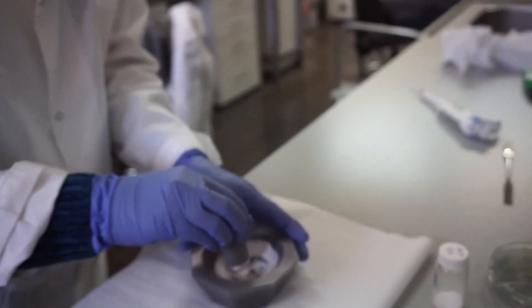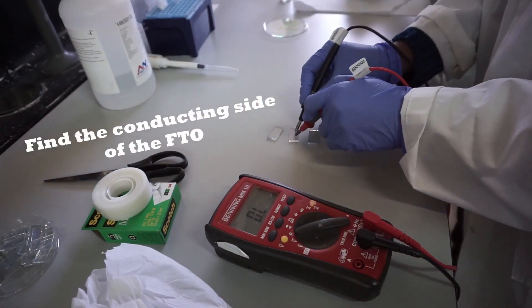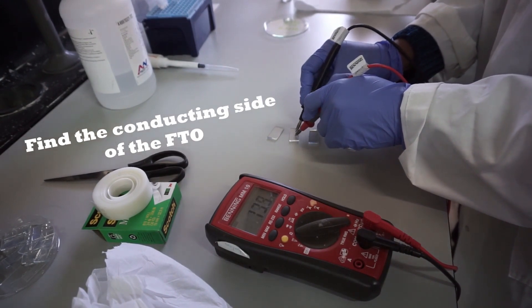Use a voltmeter to find the conducting side of the FTO. We want the conducting side to face up.